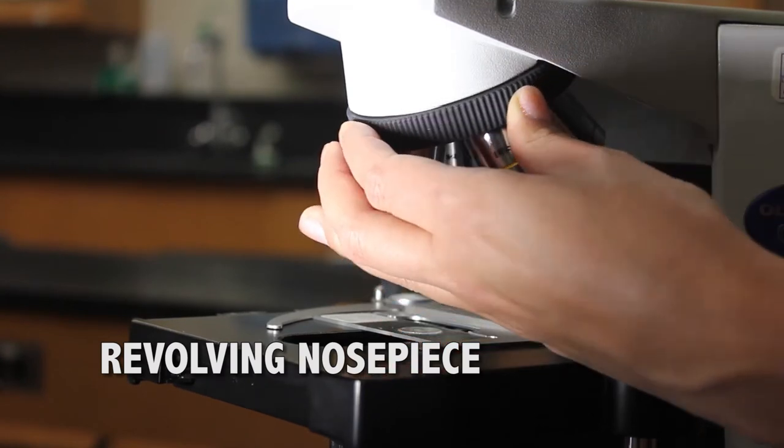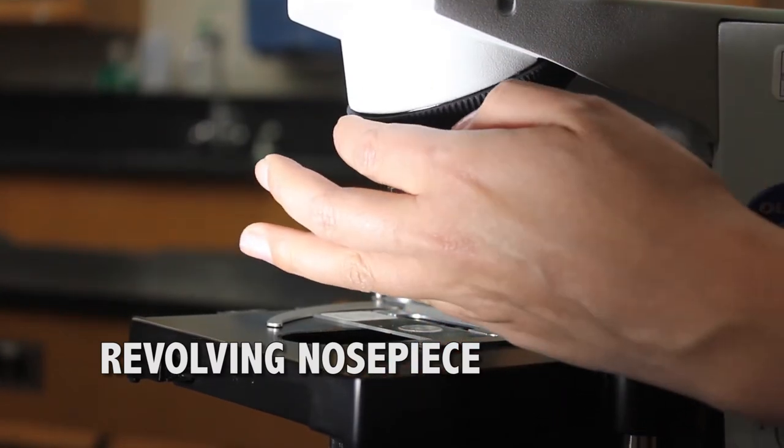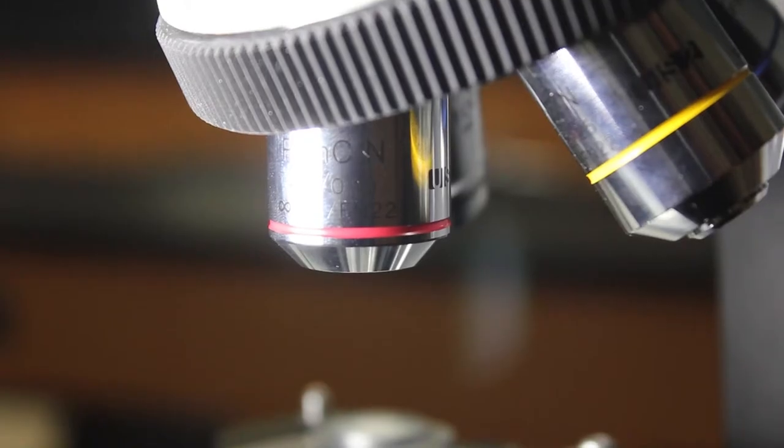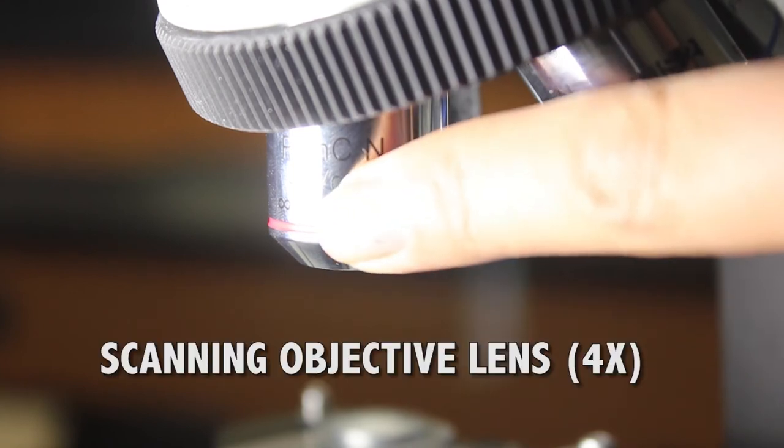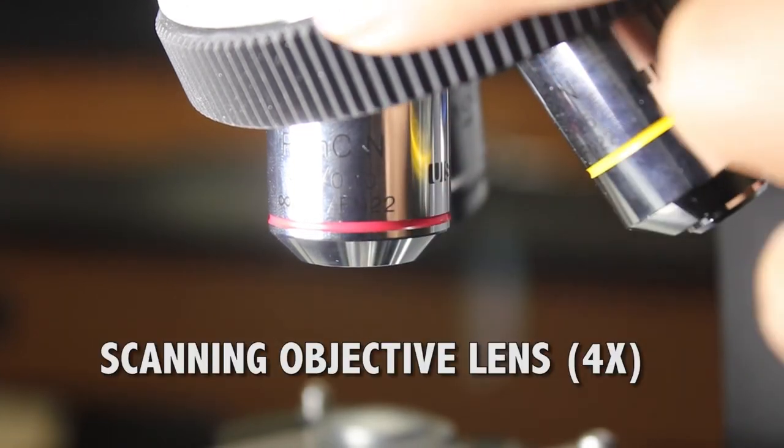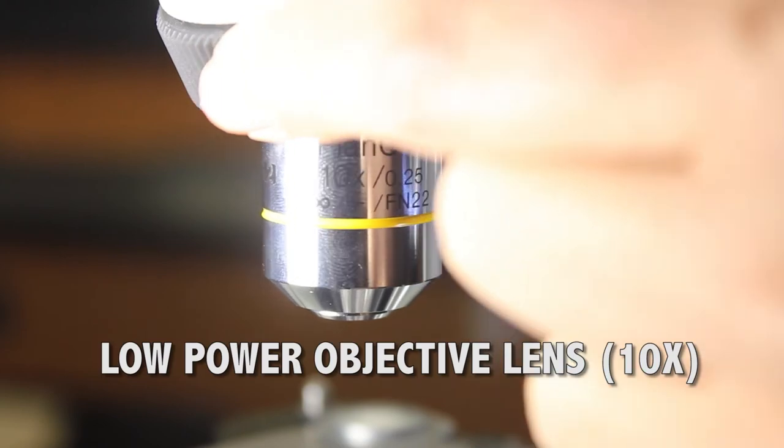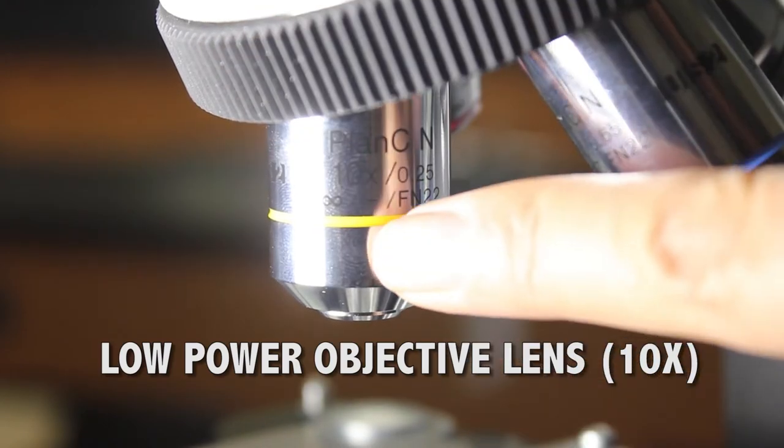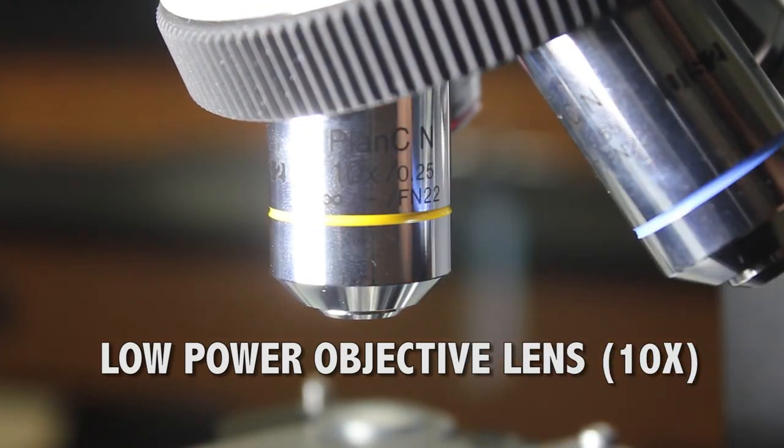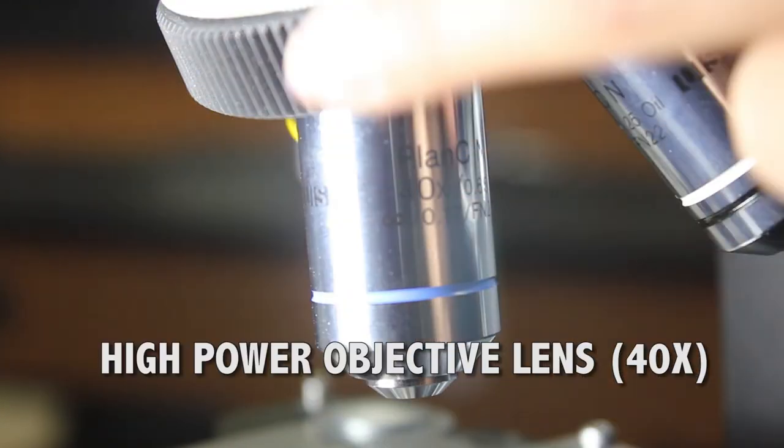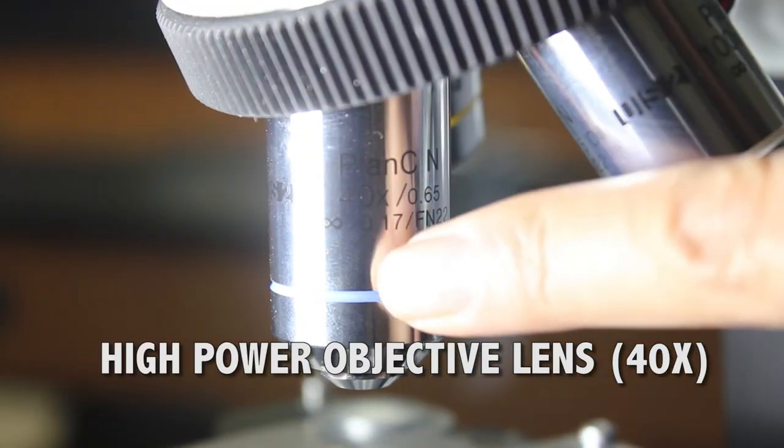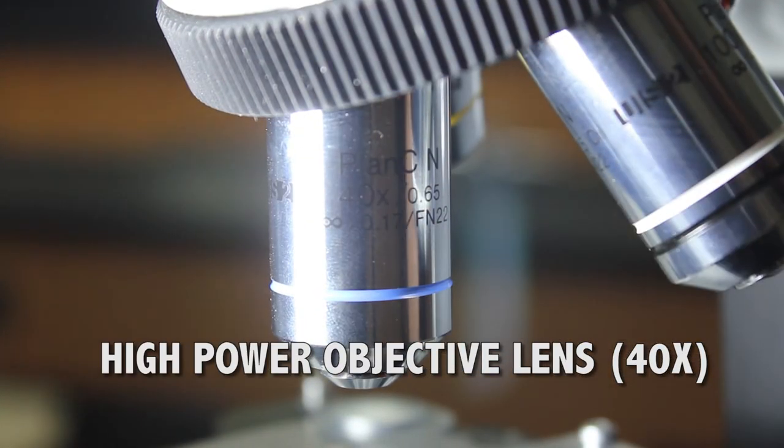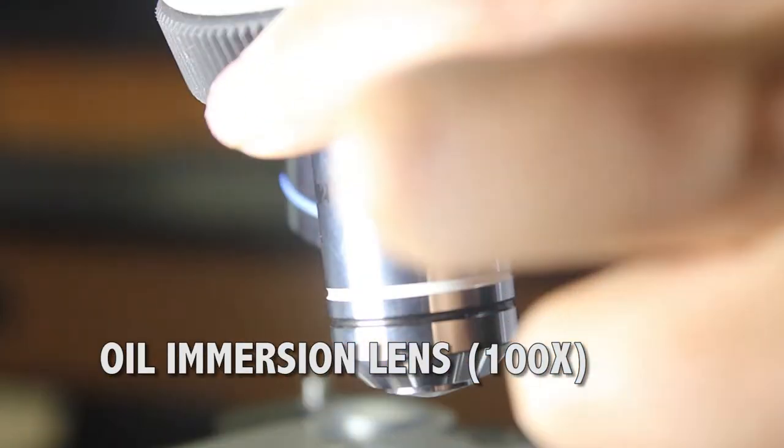The revolving nose piece holds the objective lenses. Objective lenses are marked with magnification and are color coded. Scanning objective lens is 4x. Low power objective lens is the 10x. High power objective lens 40x. And the oil immersion lens, 100x.